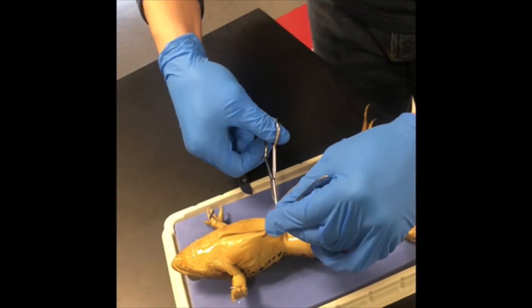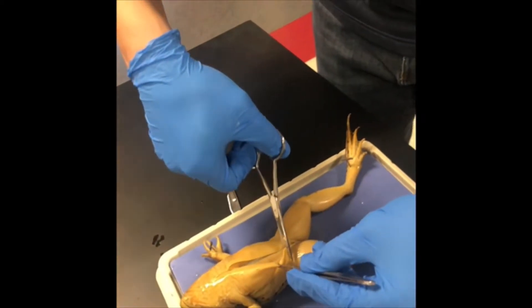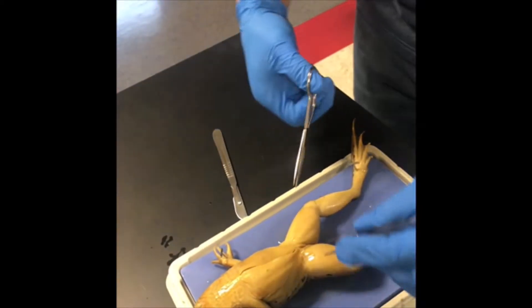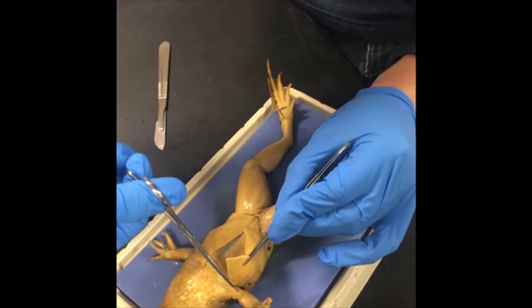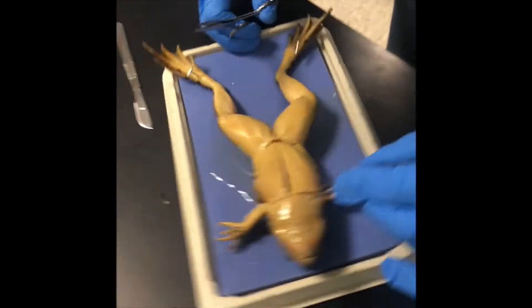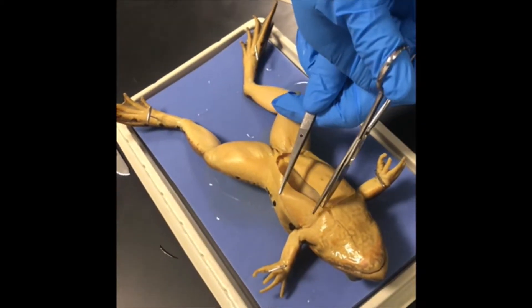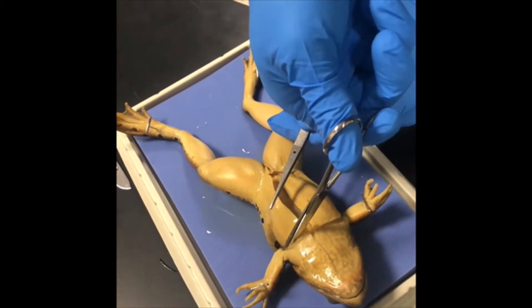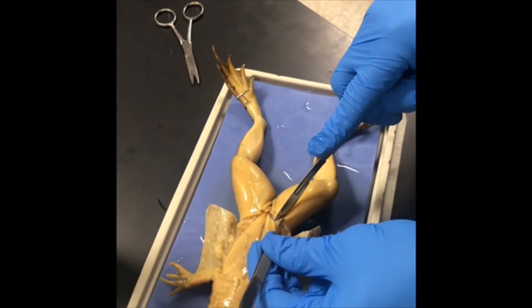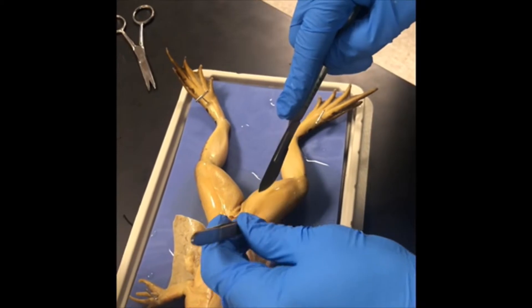Continue the skin incision by using scissors to cut all the way up the frog's body to the neck. To avoid cutting yourself, cut in a direction away from your hands and body. Make horizontal incisions just above the rear legs and between the front legs of the frog.